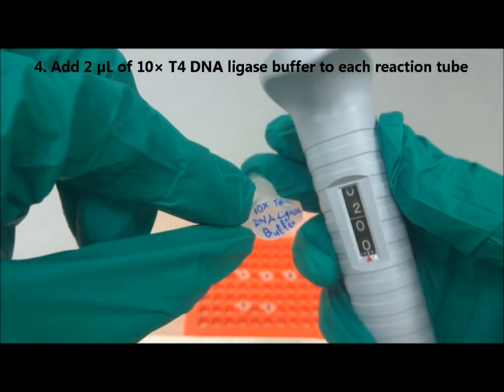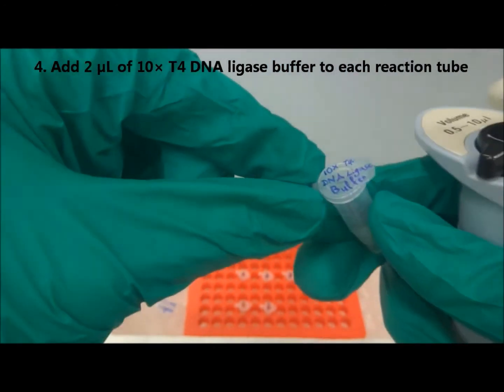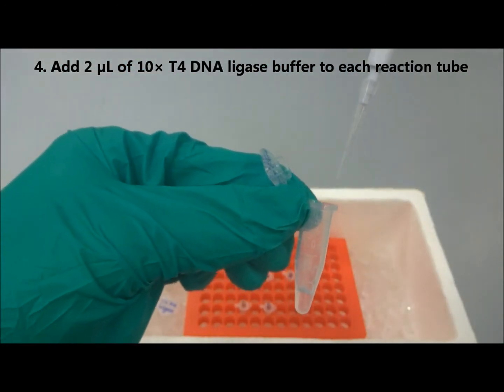Next, add 2 microliters of 10 times DNA ligase buffer into each tube.